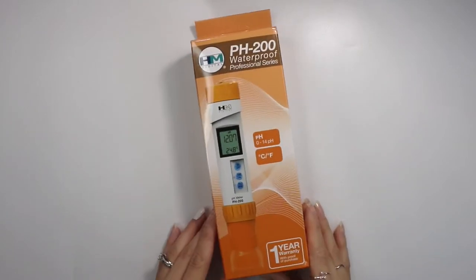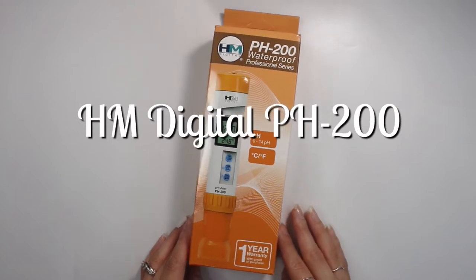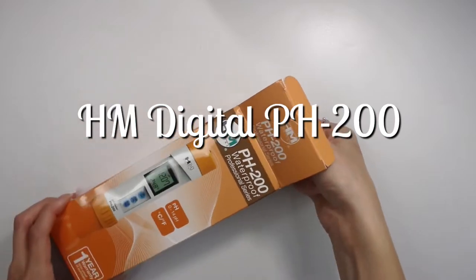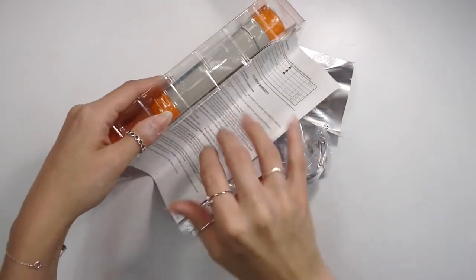Hey everybody! I recently got a new pH meter — this is the HM Digital pH 200. I paid about $70 for it and purchased it over on Amazon. I figured I'd do an unboxing with you guys and show you what to expect when you get this pH meter.